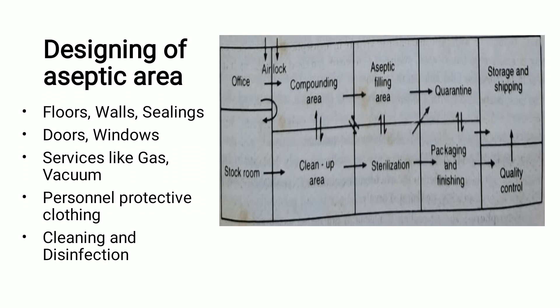Aseptic areas — also called clean rooms — are specially designed areas for controlling microorganisms. The key aspects to control in designing such an area include: floors, walls, and ceilings; doors and windows; services such as gas and vacuum; personal protective clothing; and cleaning and disinfection procedures.